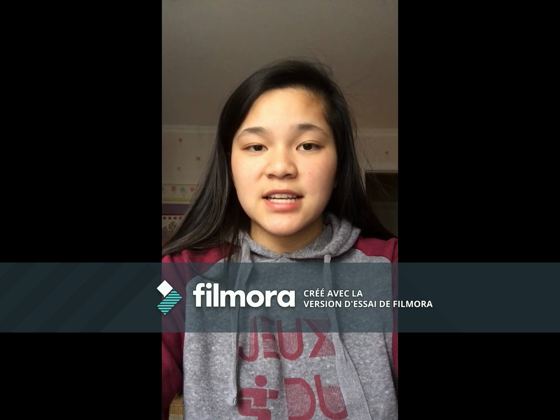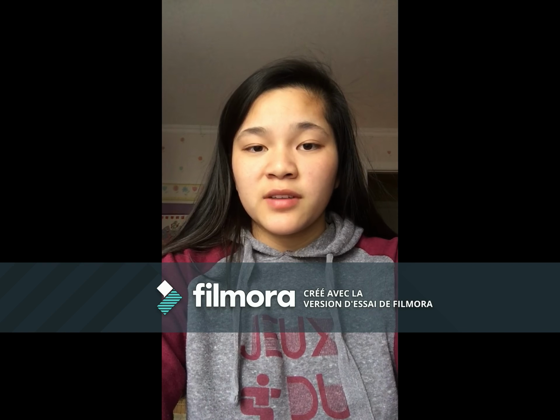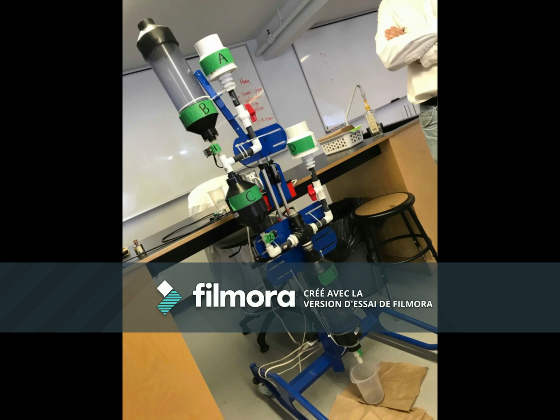Today we analyze a semi-automatic biodiesel machine made in the previous years by students. This device was built to convert soya oil into biodiesel. The compartment A is the entry of methanol and KOH. The compartment B contains water. The compartment C contains methanol and KOH. The compartment D is the entry of the oil. And finally, the compartment E contains the oil.